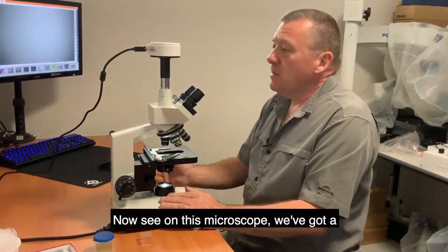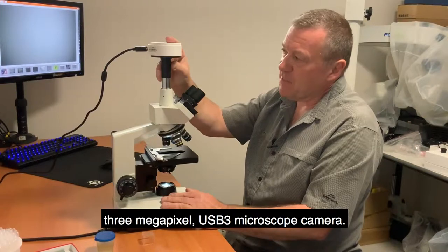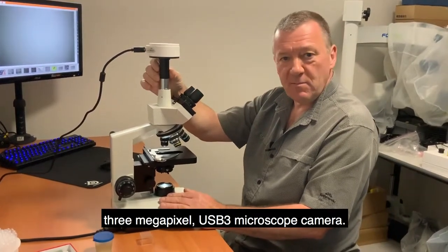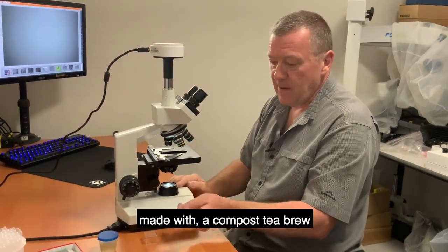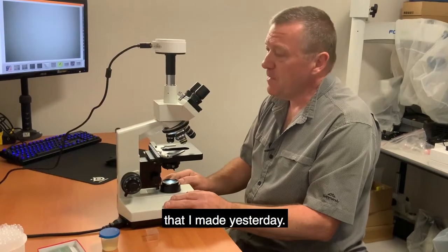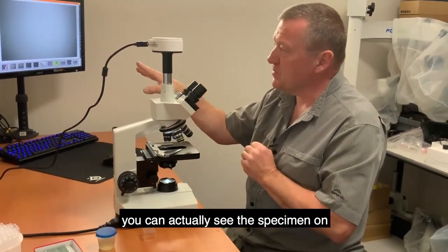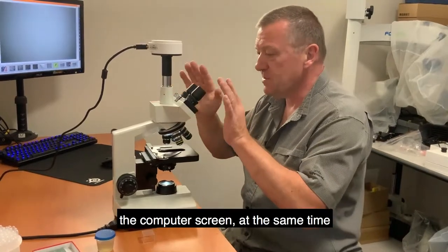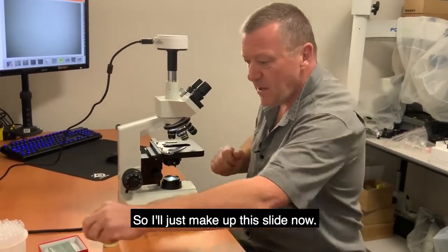On this microscope we have a three megapixel USB3 microscope camera. I'm going to prepare a microscope slide made with a compost tea brew that I made yesterday, and I'll demonstrate how you can see the specimen on the computer screen at the same time as looking down the eyepieces.